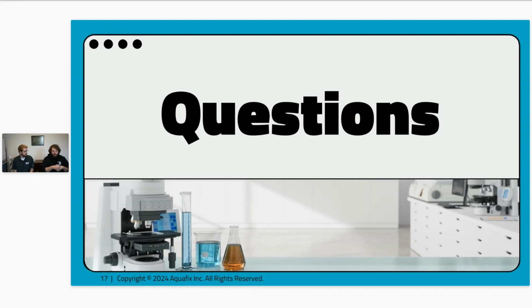Yeah, and if you have any more specific or pointed questions about any of the techniques or any of the identifications that we talked about today, always feel free to reach out. Even just help with gram stain supplies, India ink, sulfur test, things like that, or how to prepare your slide when looking under the microscope. Some of these things are difficult to talk about in a presentation like this. It might be a little easier having a direct conversation, but our goal is to help. So even if that is helping you set up microscopy at your site, we always want to make ourselves available to do that. So feel free to reach out with any questions.